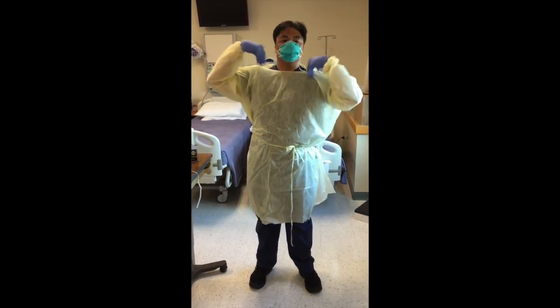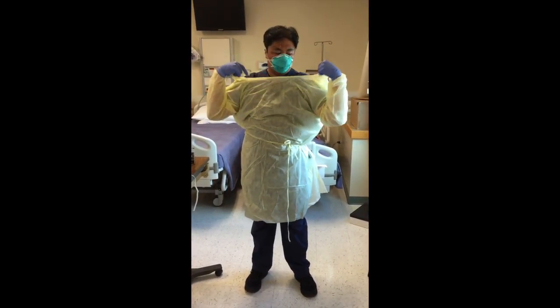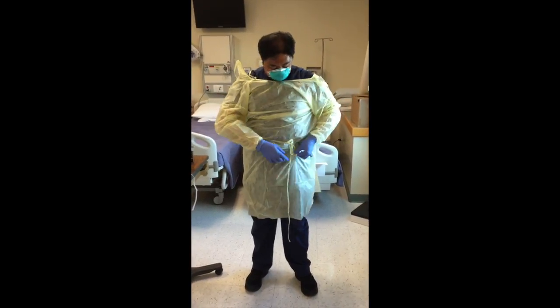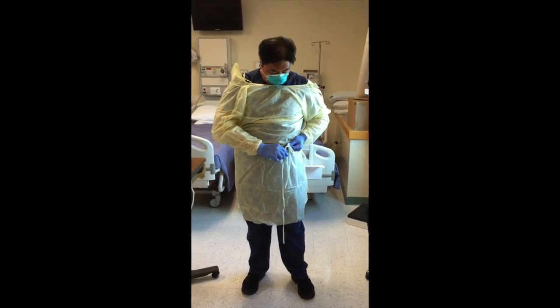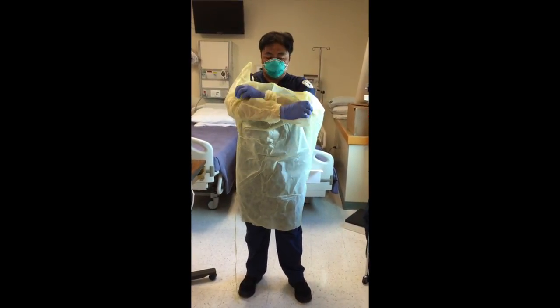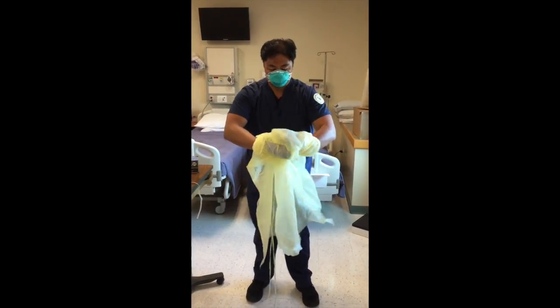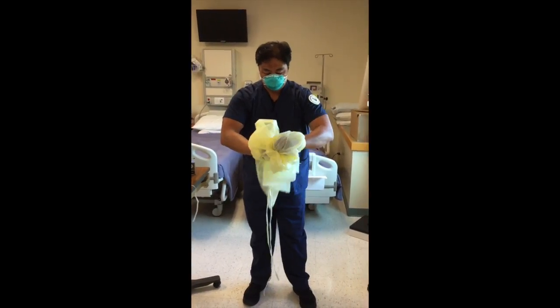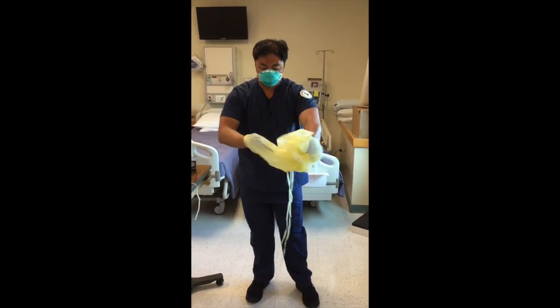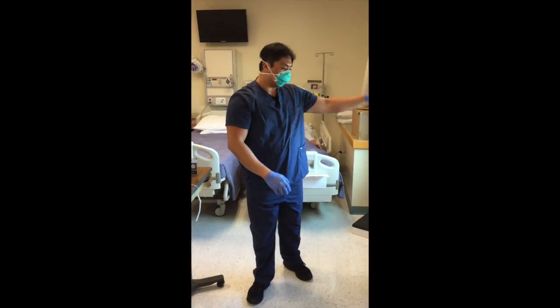What you want to do is loosen back here, then crisscross your arms, and tie this part first, then crisscross your arms, then pull away from you, and roll at the same time. Try not to touch yourself so you don't contaminate yourself. You pull these off, and then you would throw this away in the proper trash receptacle.